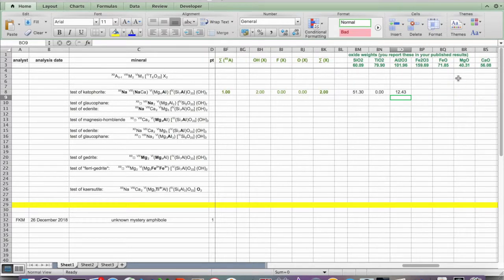Okay, so I'm going to momentarily skip iron because the calculation is a little different there, and I'm going to skip over to magnesium. Now, rather than copying the aluminum here, I'm going to copy the titanium cell, and I'm going to show you in a moment why I'm doing that. The reason that I'm doing that, of course, is because there is 1 titanium per TiO2, and there's 1 magnesium per MgO, and so this 1 divided by 1 stays the same.